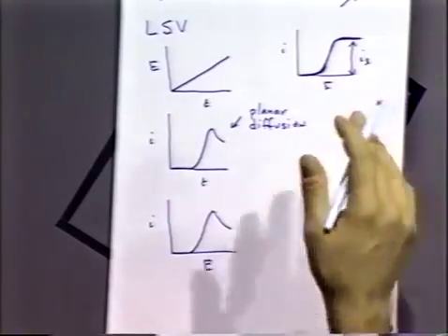I thought for now what we could do is look at some simulations of the voltammetry process, and we'll see exactly why we expect to see a peak here rather than a nice sigmoidal shape. In fact, having a peak here makes the mathematics a little bit more difficult, but it makes the curve a little bit more information rich. You can look at the shape of that peak and how it's shifted along the axis, and whether it's broad or wide, what the height is, and you get a lot of information out of that peak that you don't get out of a nice sigmoidal curve. In principle, both have the same information, but this, your eye can actually see, your brain can process those visual differences easier.